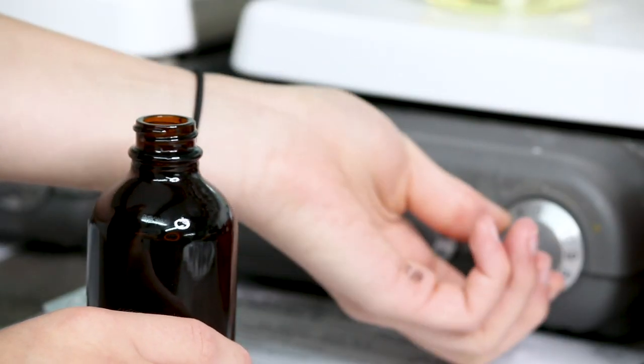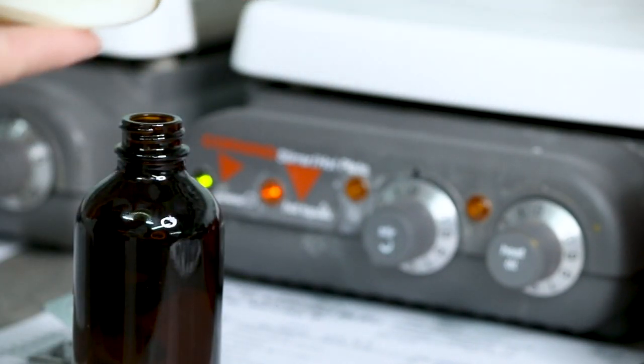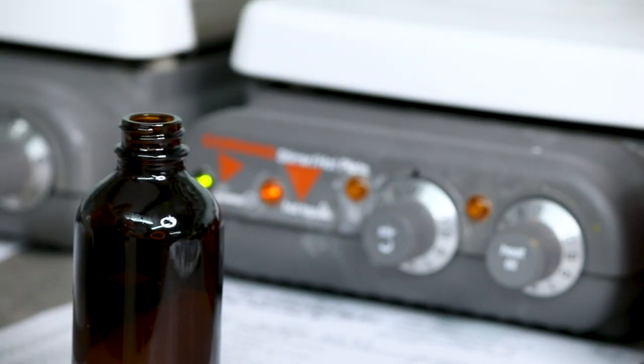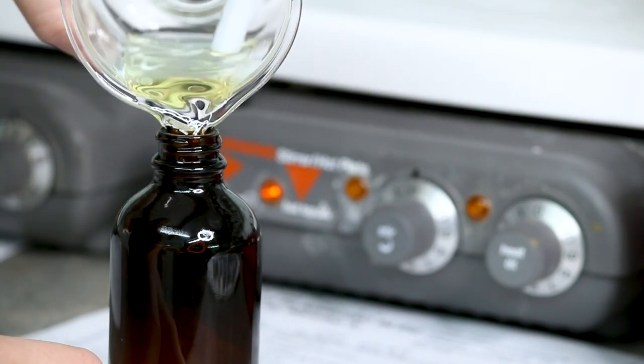Looks like the crystals are dissolved. We're now ready to pour. We use a magnet to hold the magnetic stir bar, and we carefully pour it into the bottle. Once it's poured into the bottle, we will send it back to the perfumer.